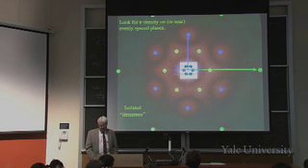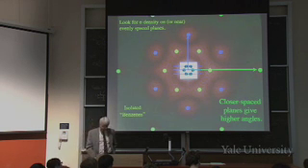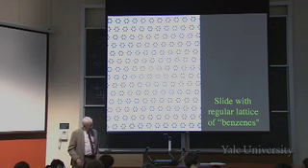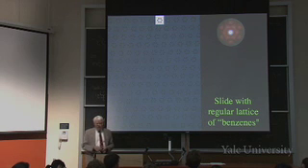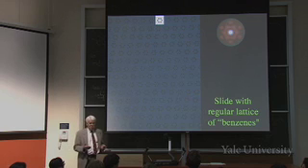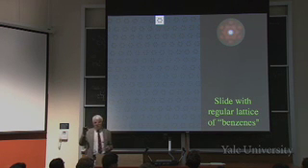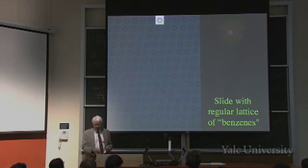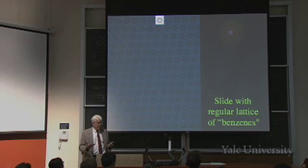Okay, so there again we notice here that the closer spaced planes give higher angles. This is what we've just been talking about. Now, when you take a slide with a regular lattice of these benzenes, then remember, if you took just one, you get this snowflake pattern. If you take a whole row across the top, right, like that. Oh, pardon me, I meant to say that one will be very weak. You can hardly see it. What you need is a bunch of them to cooperate to see something that you can see.